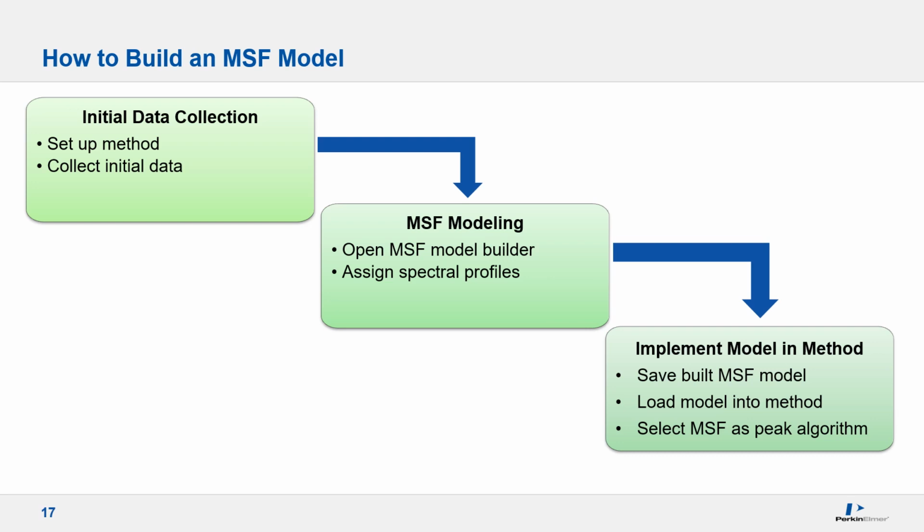Once all the blanks, single element standards, and samples are run, you will need to open the MSF Model Builder within the Examine window and assign the spectral profiles. Then it is as simple as saving the model and implementing it in your instrumental method.